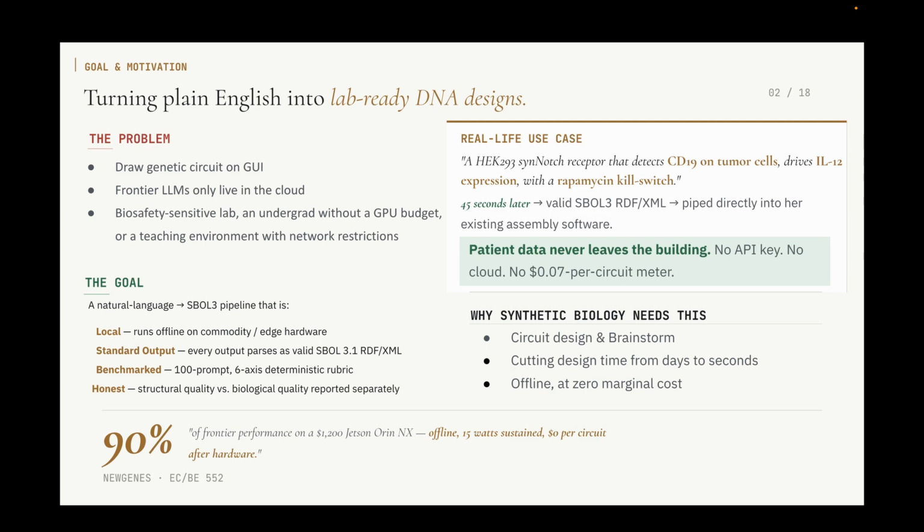And sometimes you don't want to disclose your design online or worry about the safety of your data, or you don't have enough budget to use frontier LLMs, or just want to use it for educational purposes. Therefore, we want to build a product that runs locally, takes natural language, and turns it into a valid SBOL3 design at no additional cost.